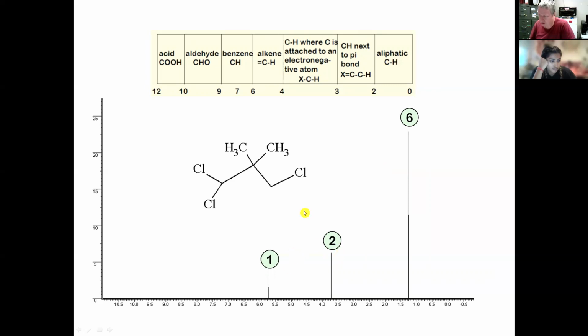But what about chemical shift? Like this carbon has how many chlorines on it? The CH. Oh, it's got 2. So it's kind of like a double effect, right? That's why it's additive. And is that 5 to 6? Which is weird because that would probably be where the alkenes come. But again, that just shows that this table is not perfect, because if you have a weird situation like 2 chlorines, then this table is not going to work, right?